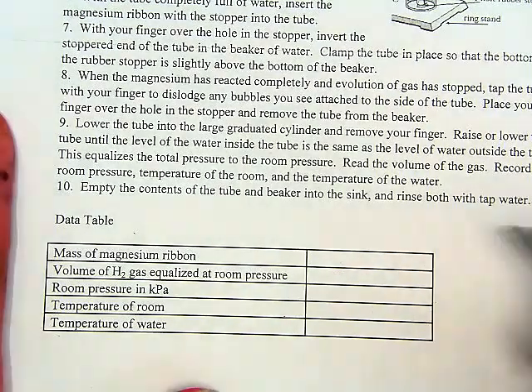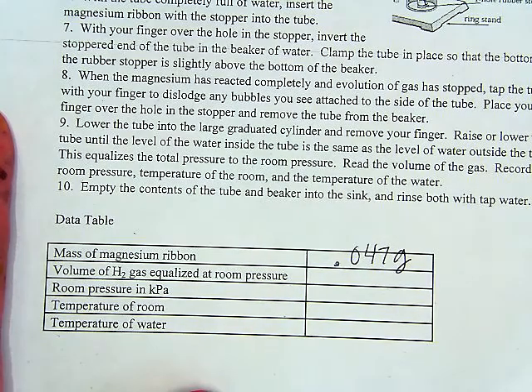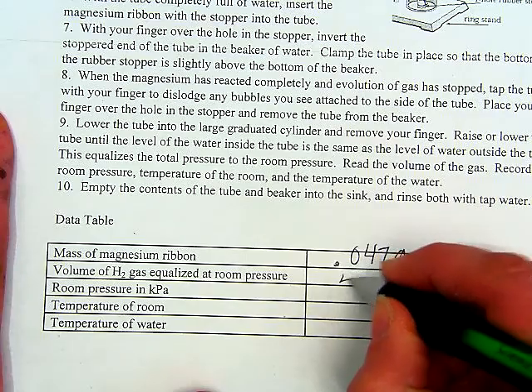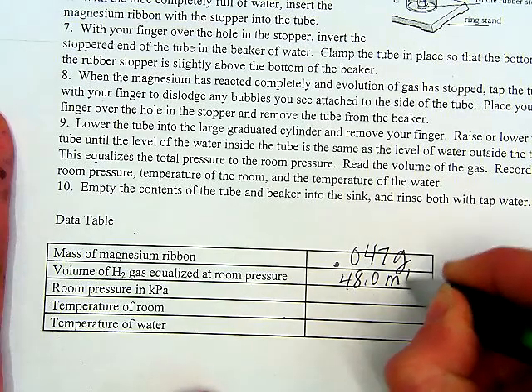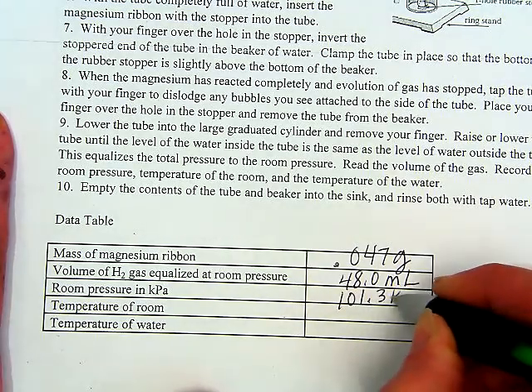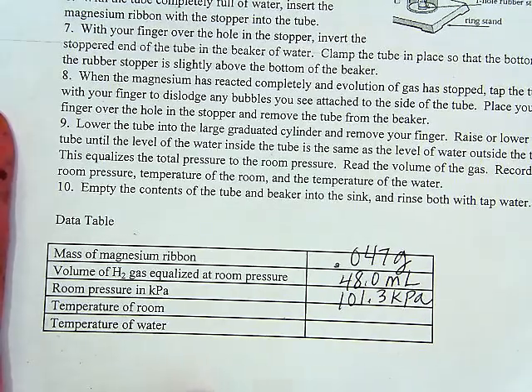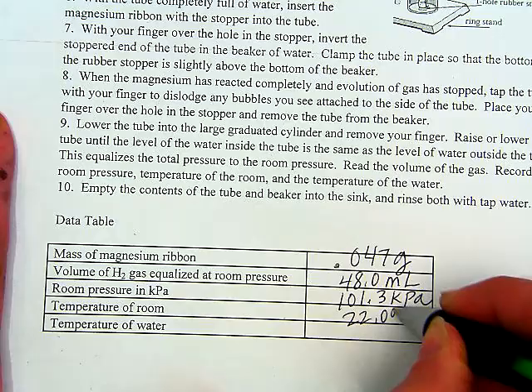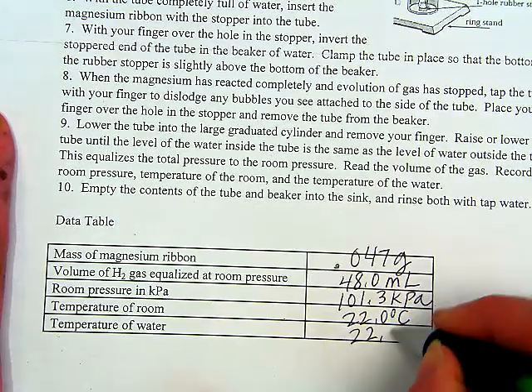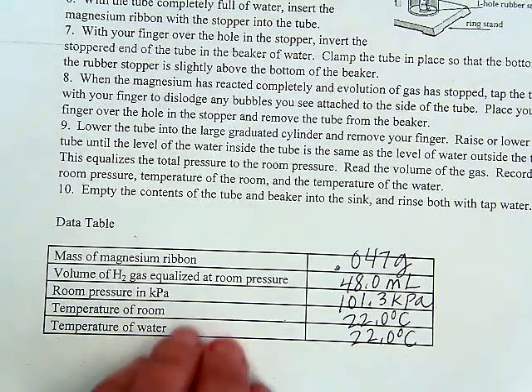All right, so my partner and I collected some data. We measured the mass of the magnesium ribbon. This was my number, 0.047 grams. That's two significant figures. The volume of the gas was equalized at room pressure, and we found that we had 48.0 milliliters. The barometer read 101.3 kPa for that day. The temperature of the room was 22 degrees, and we did this at the end of the day, and the water had already equalized also to 22.0 degrees Celsius.